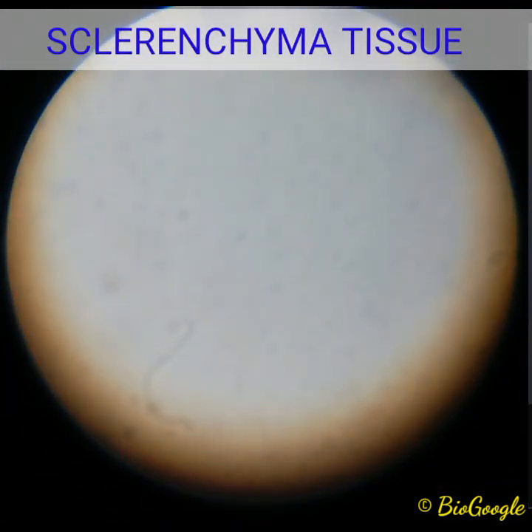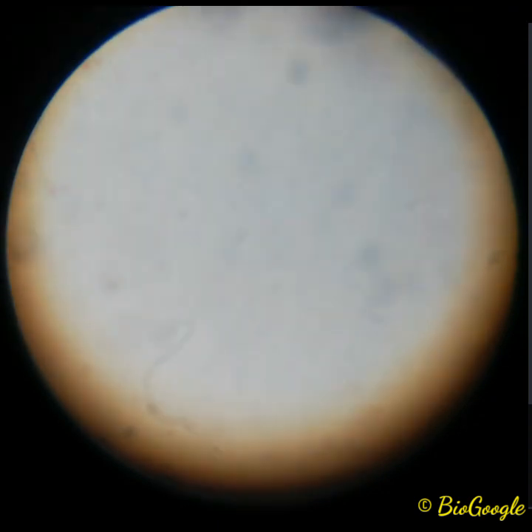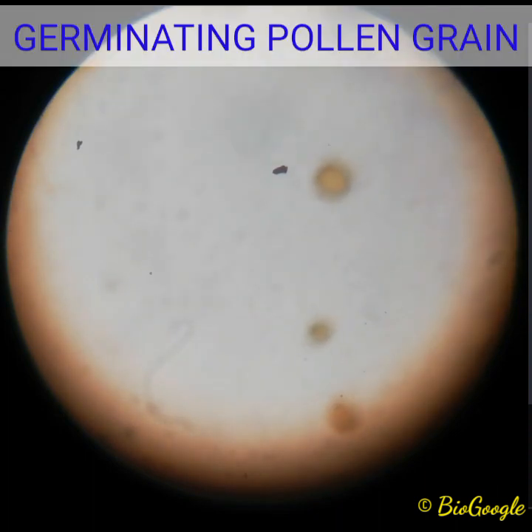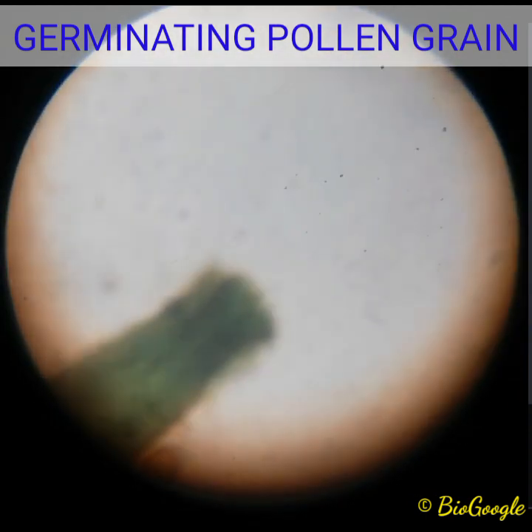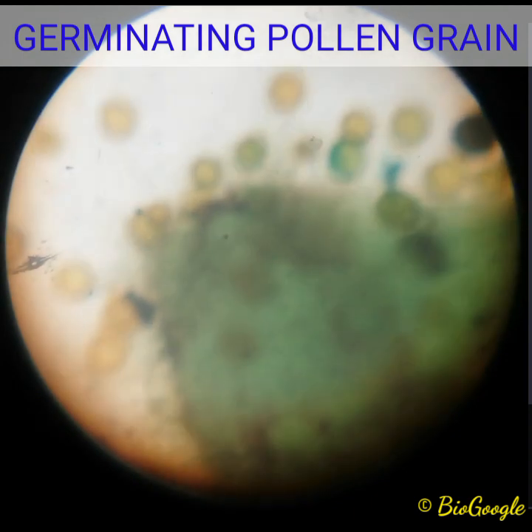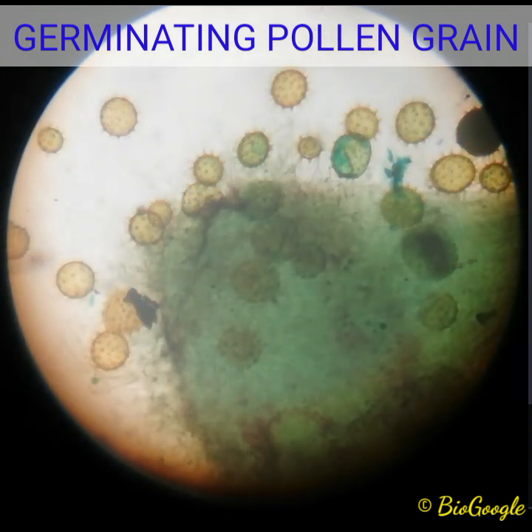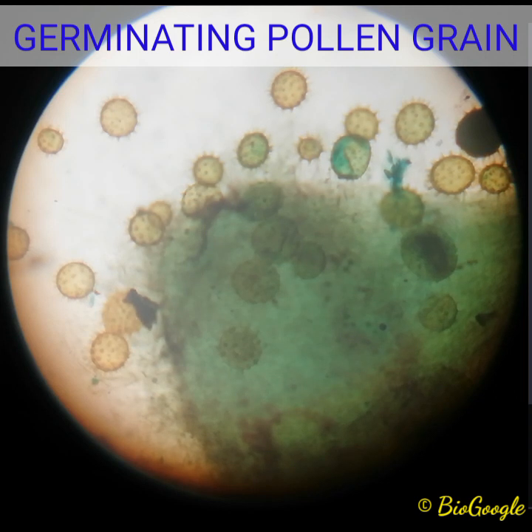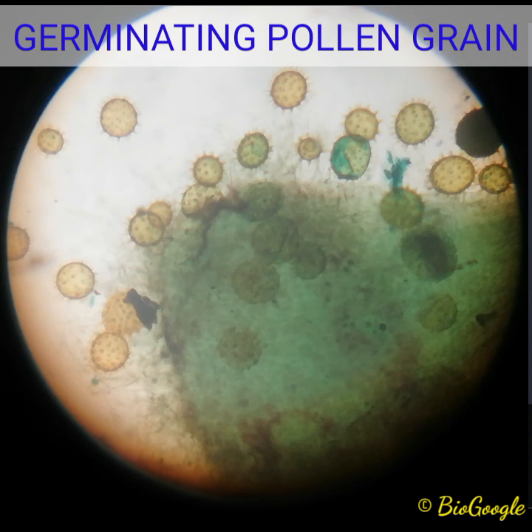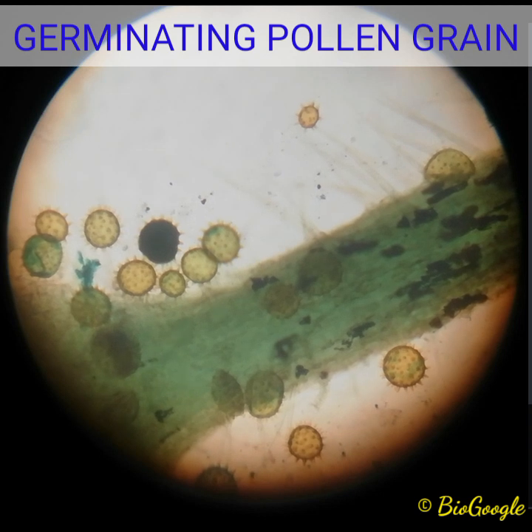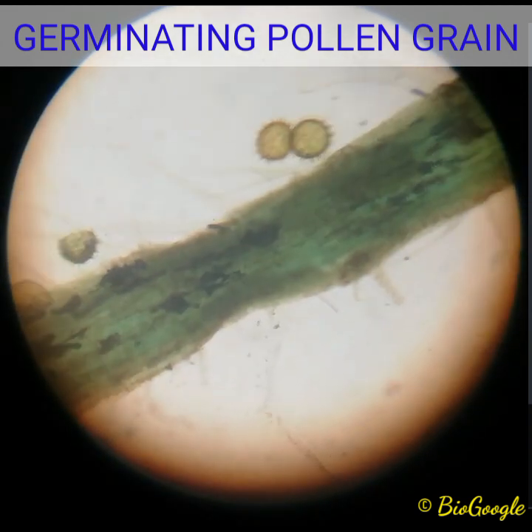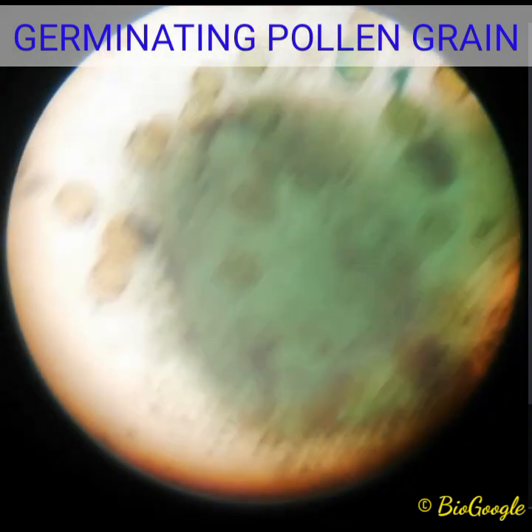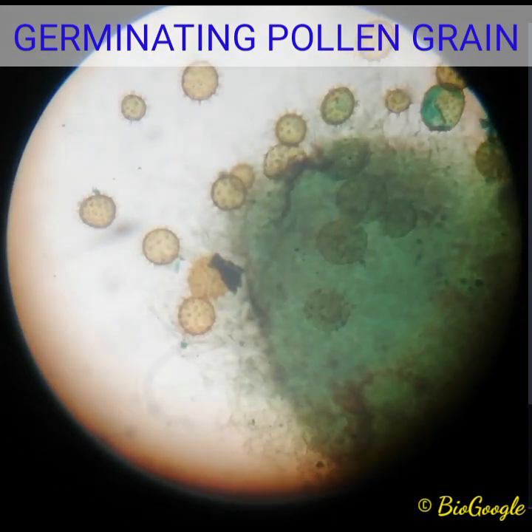Next is one of the interesting slides — pollen grain germinating on the stigma. You can see the pollen grains here. When we study the structure of pollen grain, we discussed that the pollen grain is covered by two layers: exine and intine. Exine has special designs over it, and here you can clearly see the exine with the architecture on it. Whatever the blue part here, that is the stigma. You can see the stigma of any one of the plants — and through that stigma in the style, the pollen tube will be formed. You can clearly see the pollen grain and the stigma of the flower.